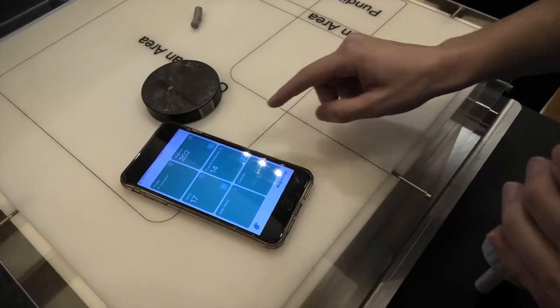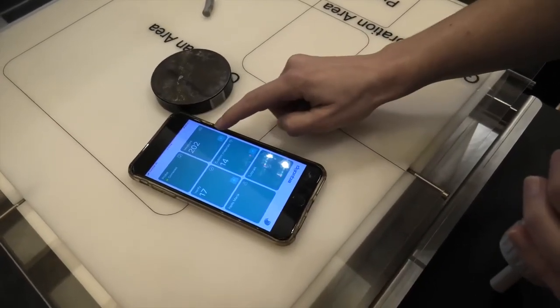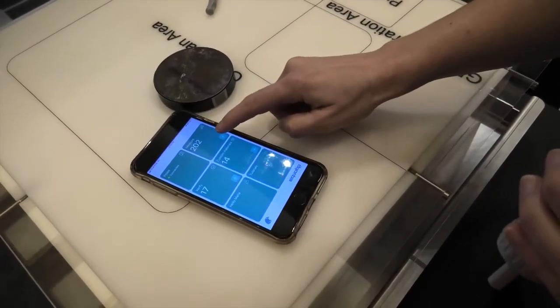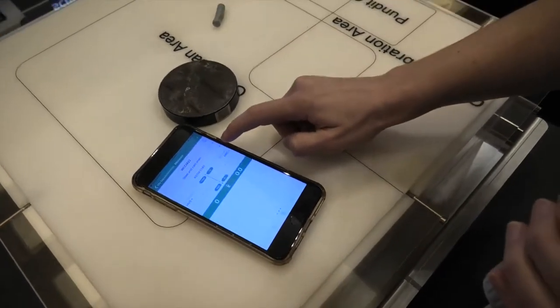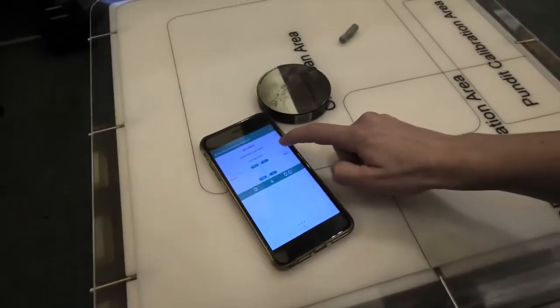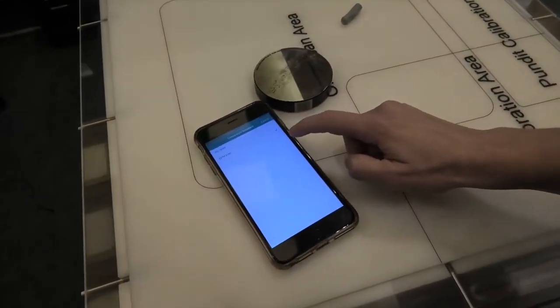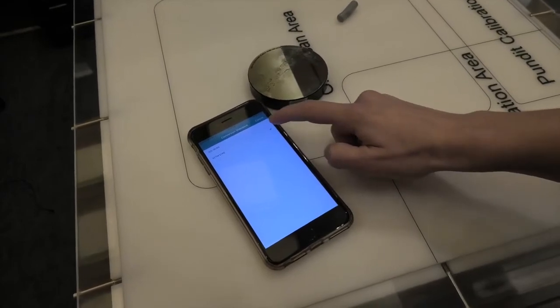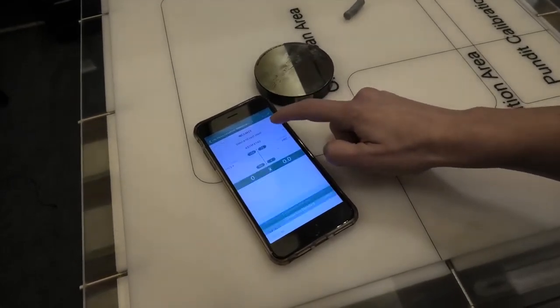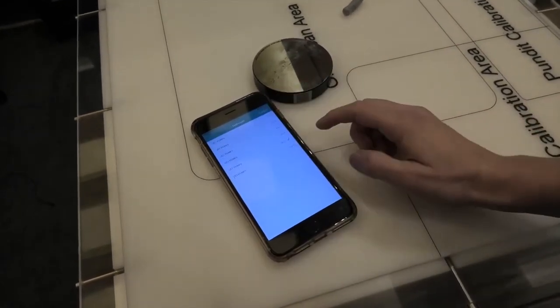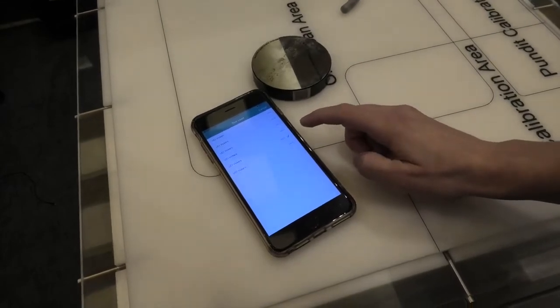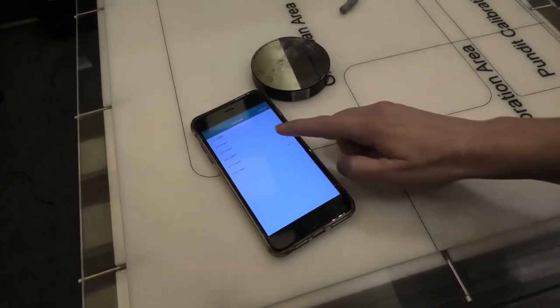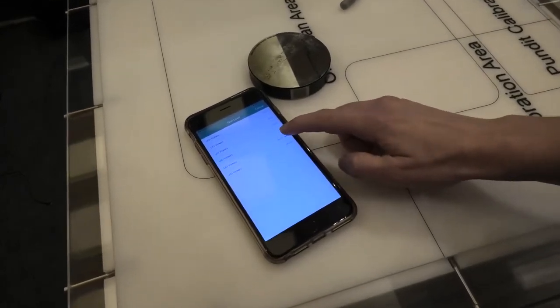To start a new measurement, we press the plus sign in the measure tile. We choose which standard we want to use, ASTM or ISO. And we also choose the loads that we want to use. In this case, I've chosen HV5.